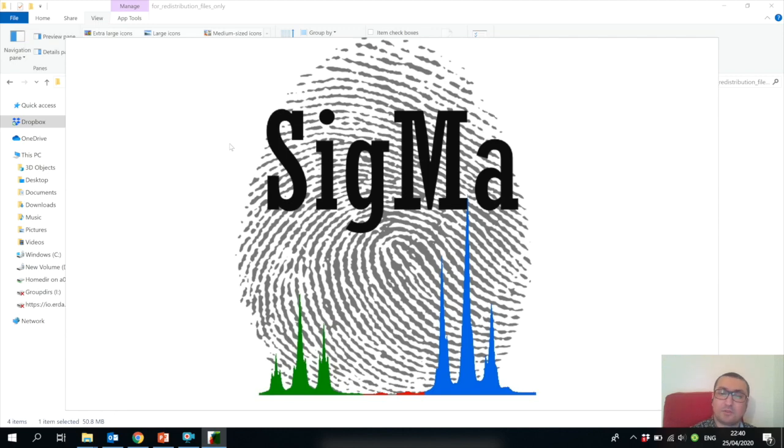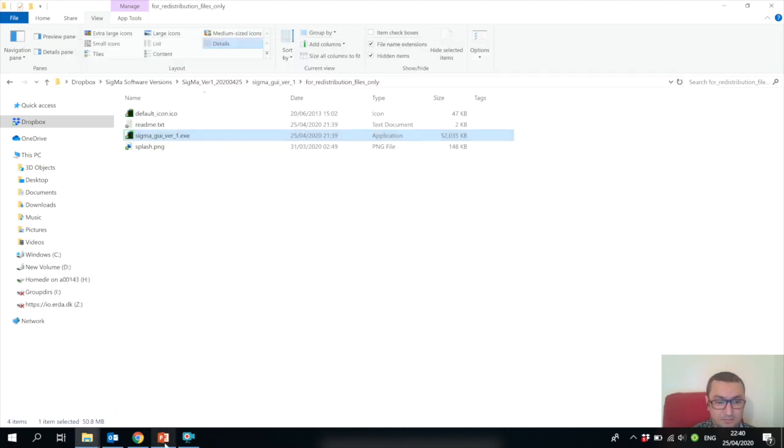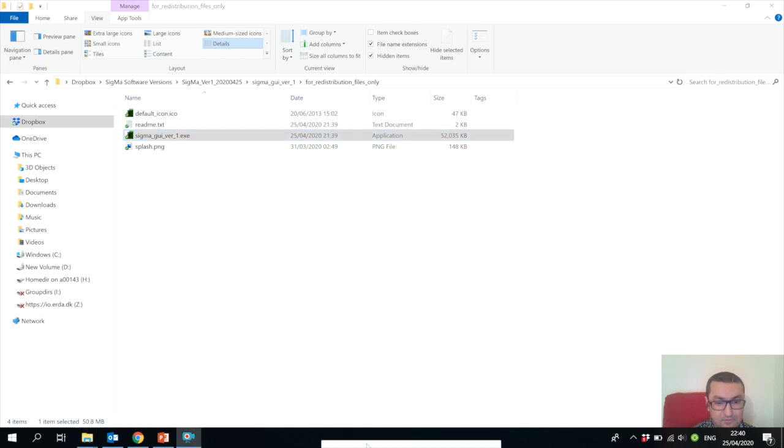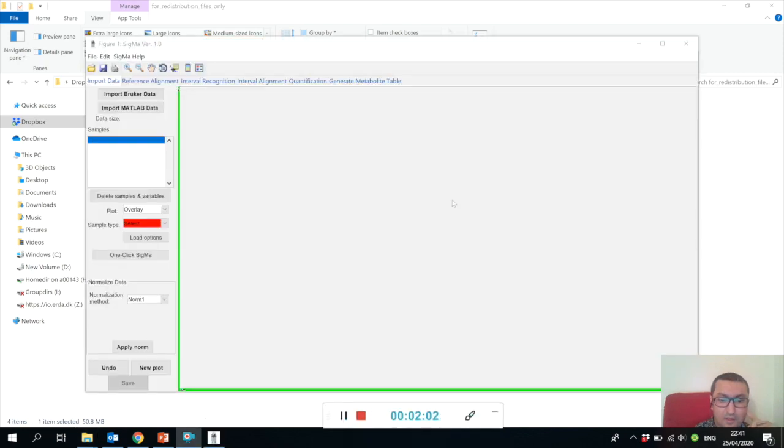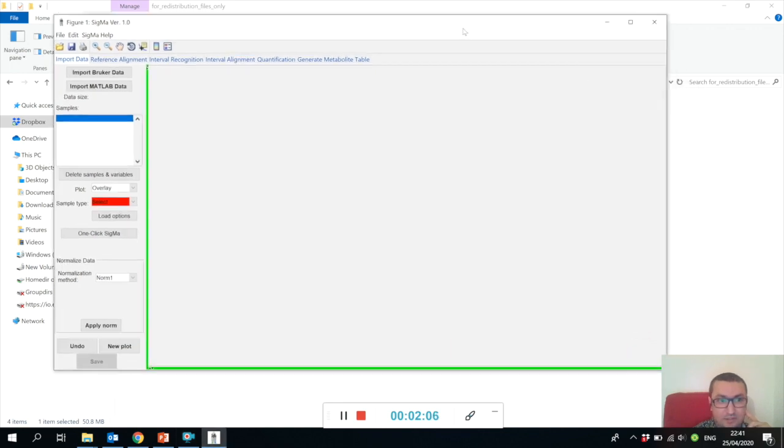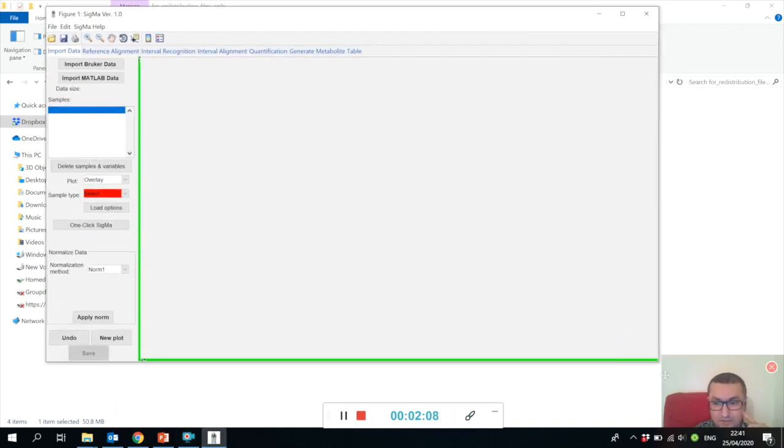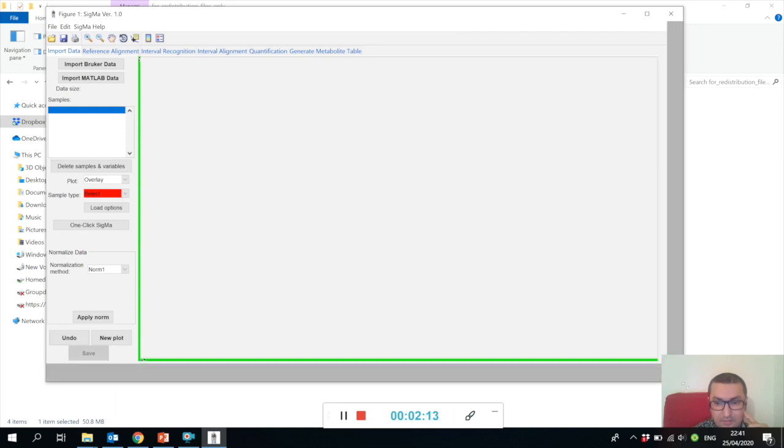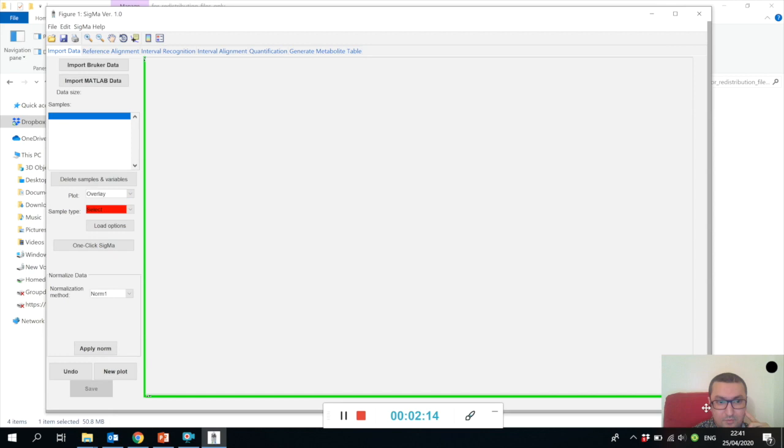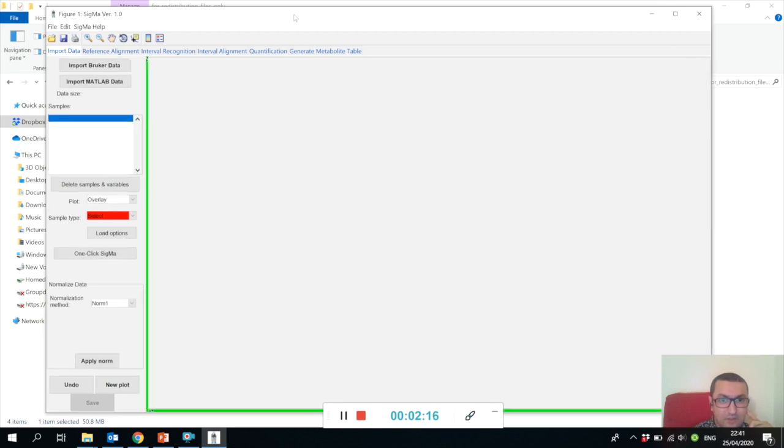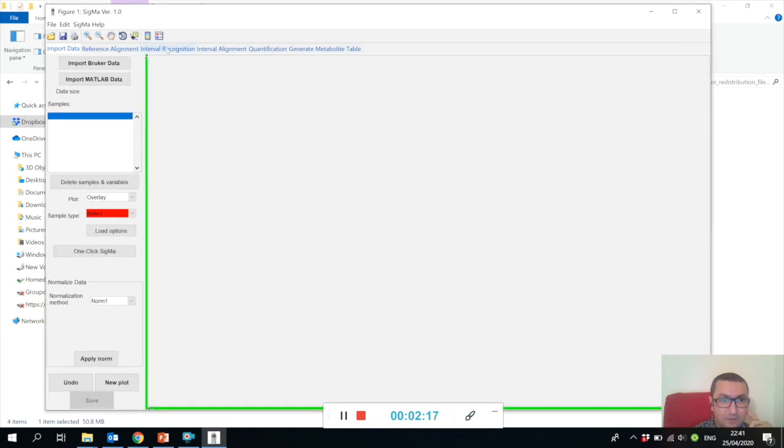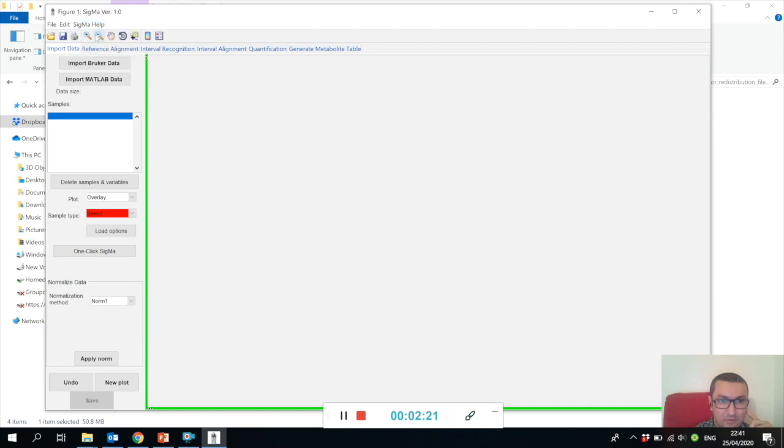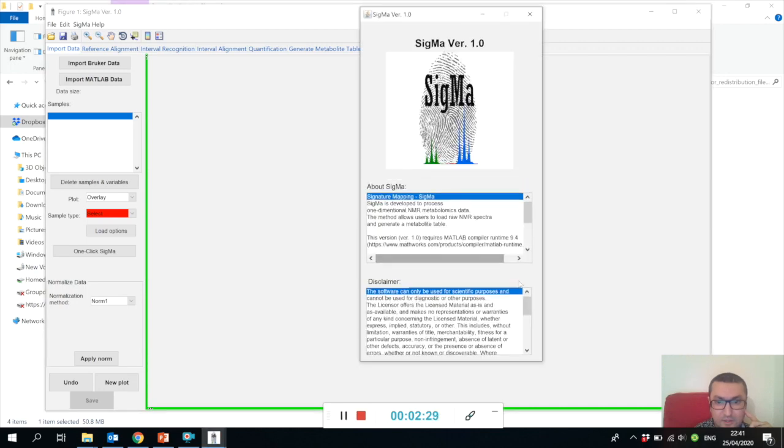When Sigma opens, you will see a graphical user interface which looks like this. I would highly recommend that before you start using it, please go to the Sigma Help and read about Sigma. Here you will see information about the software, and please read the disclaimer.